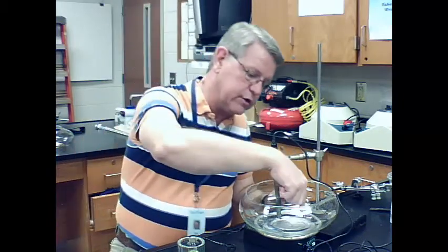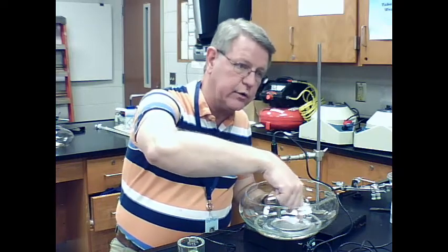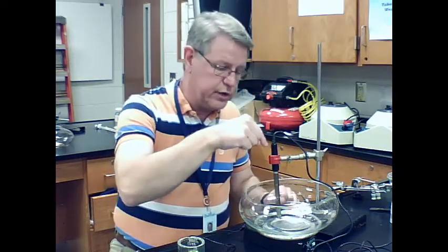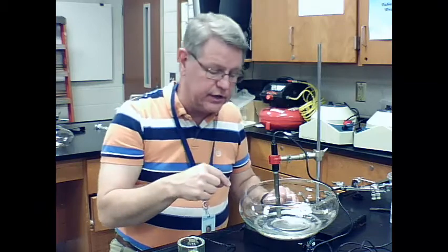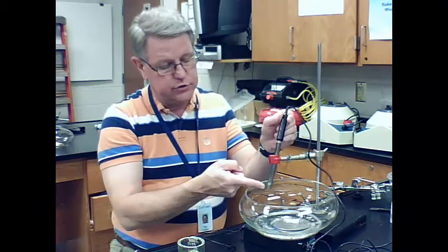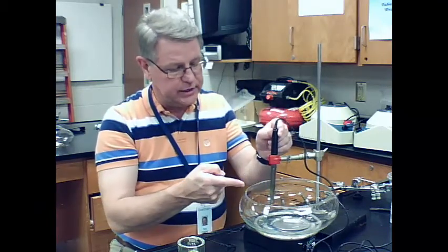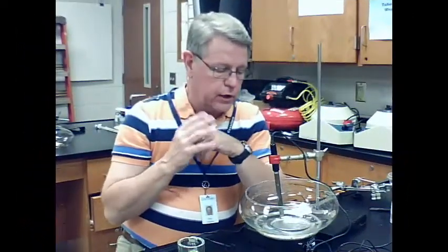Now, in this bowl, there's kind of an indentation down here around the edges. This pH probe needs to go down into that indentation, and so the sensor here at the very tip of the probe is actually in the acid solution like that.